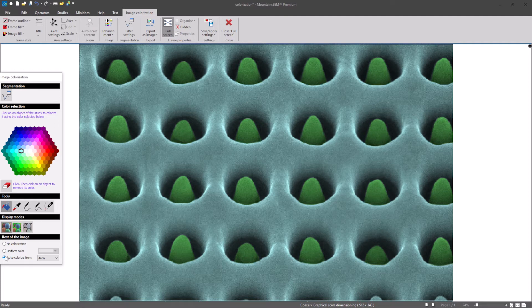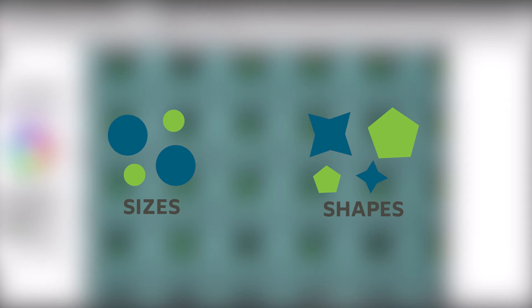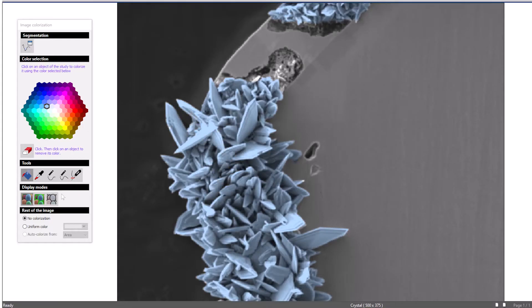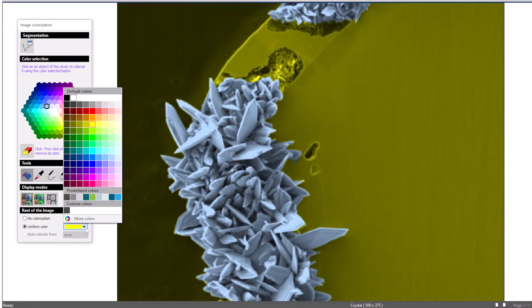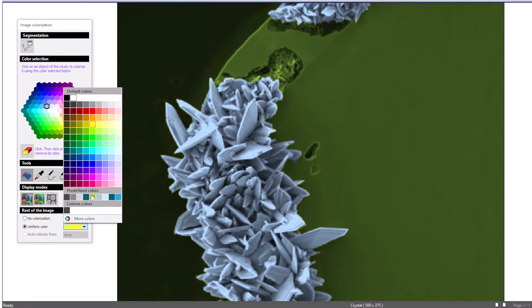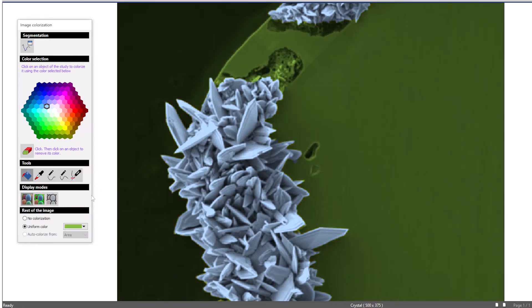The software is capable of colorizing the remaining objects in the image based on their size or shape. You can also choose a background color with which Mountains will colorize the rest of the image.